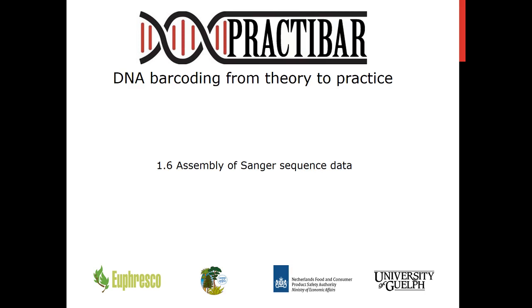My name is Bart van der Vossenberg and this is presentation 1.6, Assembly of Sanger sequence data of the Practibar course package. During the Practibar course, background information and hands-on training is provided for the use of DNA barcoding in the framework of plant health.